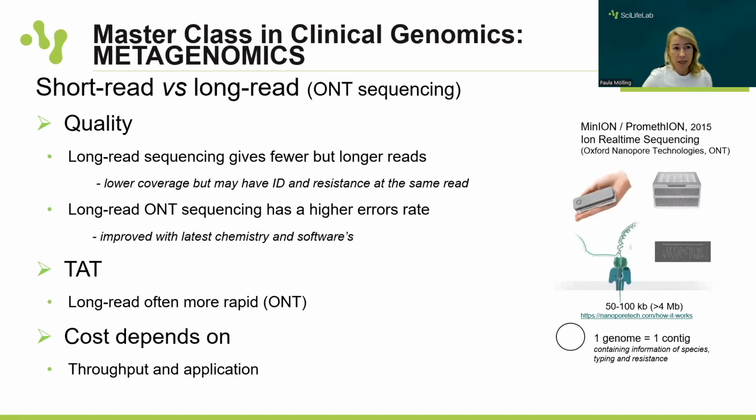So if we compare short read to long read sequencing, here I have chosen to compare it with the ONT, Oxford Nanopore Technology sequencing, since that is more advantageous to use in clinical metagenomics.